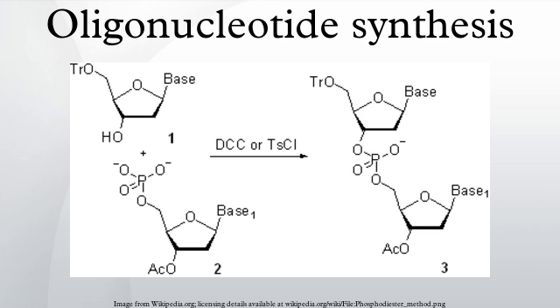Generally, the larger the scale of the synthesis, the lower the excess and the higher the concentration of the phosphoramidites used. In contrast, the concentration of the activator is primarily determined by its solubility in acetonitrile and is irrespective of the scale of the synthesis. Upon the completion of the coupling, any unbound reagents and byproducts are removed by washing.